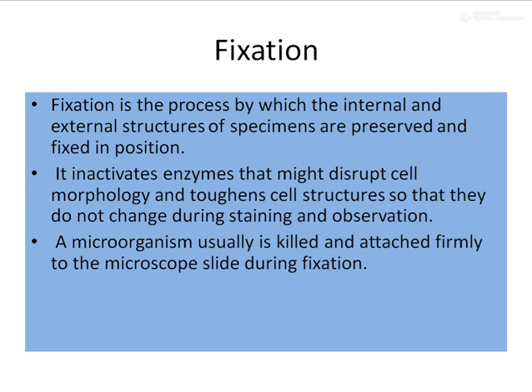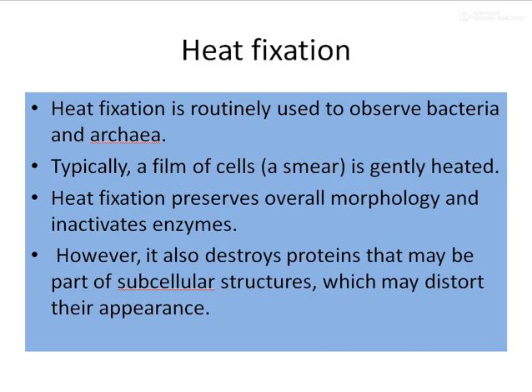Now, how can you do this fixation? There are two different modes. You can either give a heat fixation or you can give a chemical fixation.